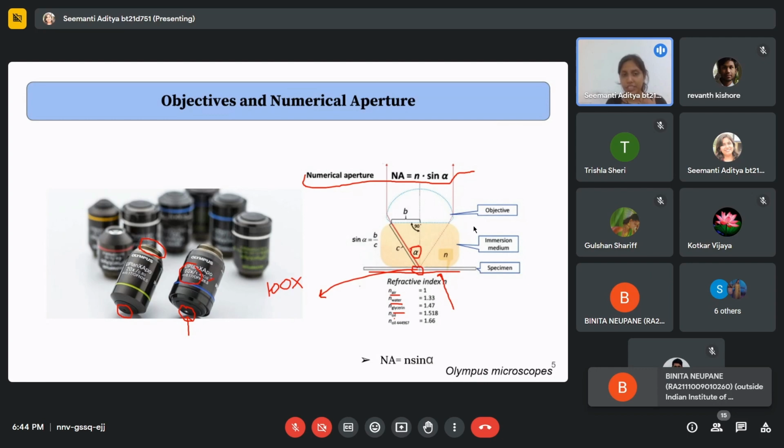Whenever you start imaging or microscopy experiments, it is very important to see what kind of objective you are dealing with: whether the objective is compatible with oil, what resolution it has, and whether it is sufficient to see what you want to see, to distinguish between the organelles or not. Everything is written on the objective.